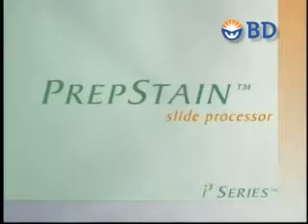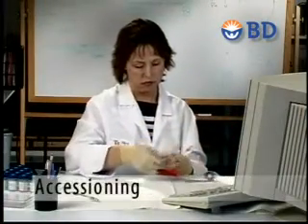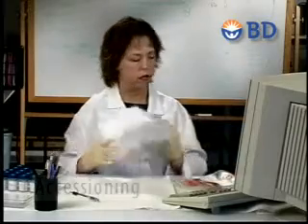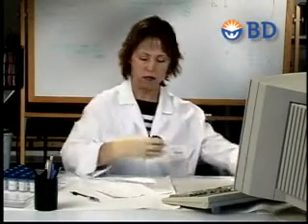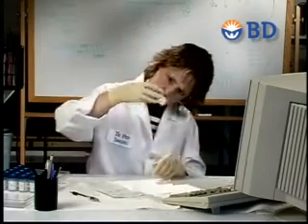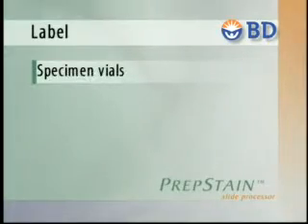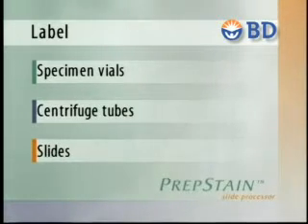Let's take a closer look at the prep stain process. Cervical samples collected in SurePath preservation fluid are received from a clinician's office and accessioned according to the laboratory's protocol. Each vial is checked for proper labeling and is visually inspected to ensure it contains the head of the sample collection device. Specimen vials, centrifuge tubes, and glass slides are labeled. Barcode labels are recommended but are optional.